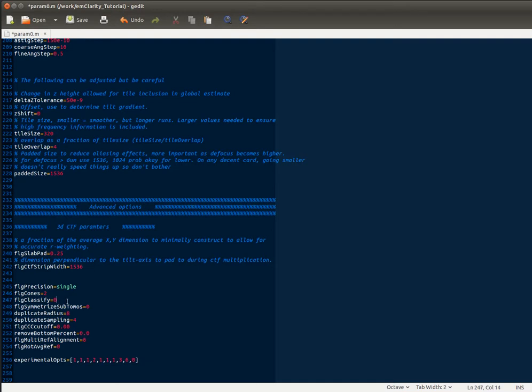Classification is disabled until you turn it on. This parameter is important—the flag symmetrized subtomos. So if you've specified that you have symmetry, that will be applied to the averaging of your subvolumes so that you get a higher signal-to-noise reference. It can also be applied in the alignment, which is a unique feature in EMClarity because we interpolate the particles back into the base reference frame of the microscope. It's, however, very expensive in terms of computation. So if you have a six-fold symmetry, you have to do six times as many interpolations for every single position you examine in the alignment. In your very end stages, it can be useful. So you can turn this on to one if you would like. But if you leave it at zero, then the symmetry is only applied to the averaging and not the alignment.